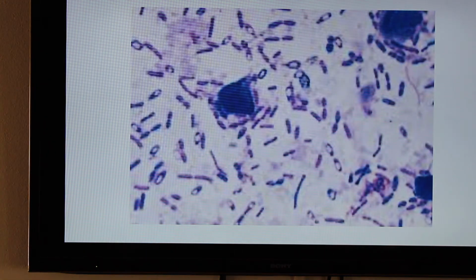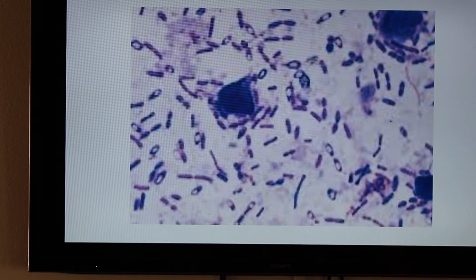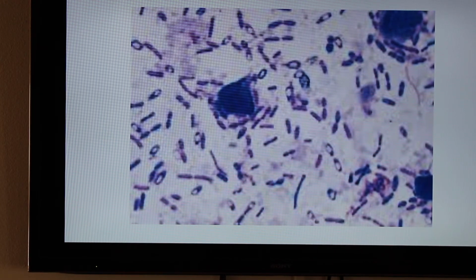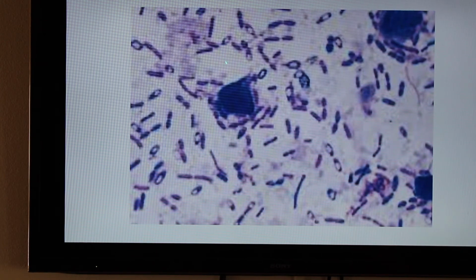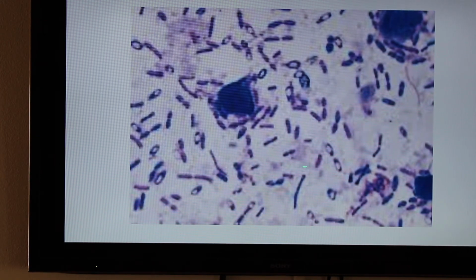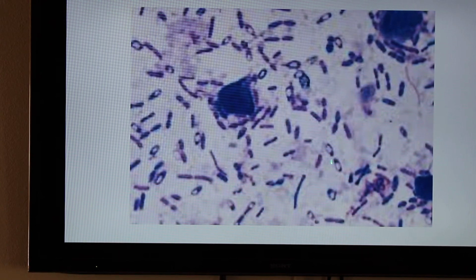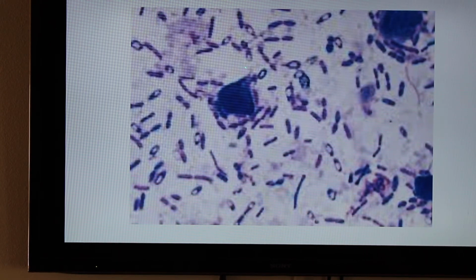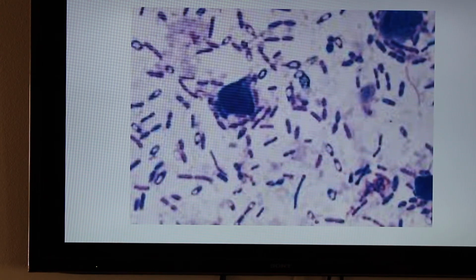This is bringing us a little bit back to micro, where we talked about getting diarrhea in our young animals. Clostridium perfringens is one of our most common types of bacteria that's causing diarrhea. As you can see, they have these little sporulated bodies as well, and that's a way to recognize them.